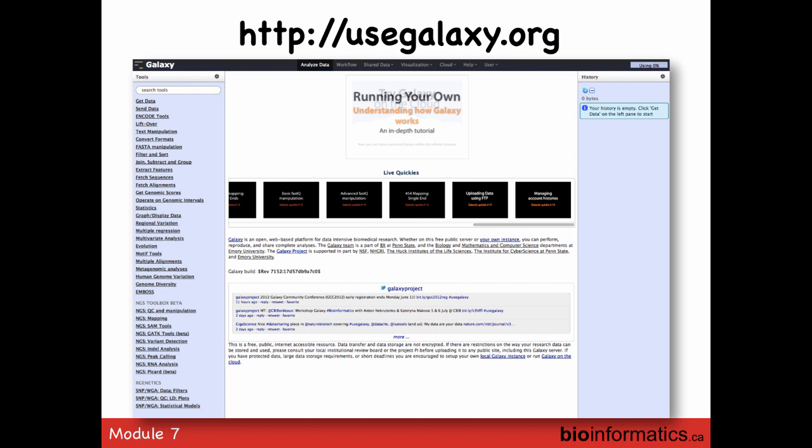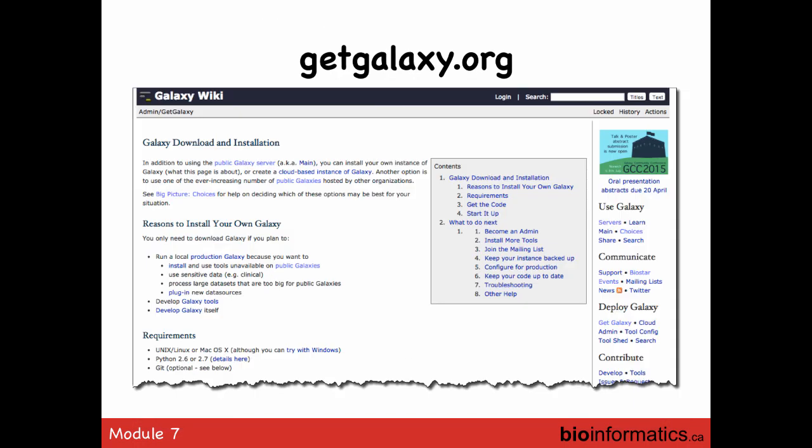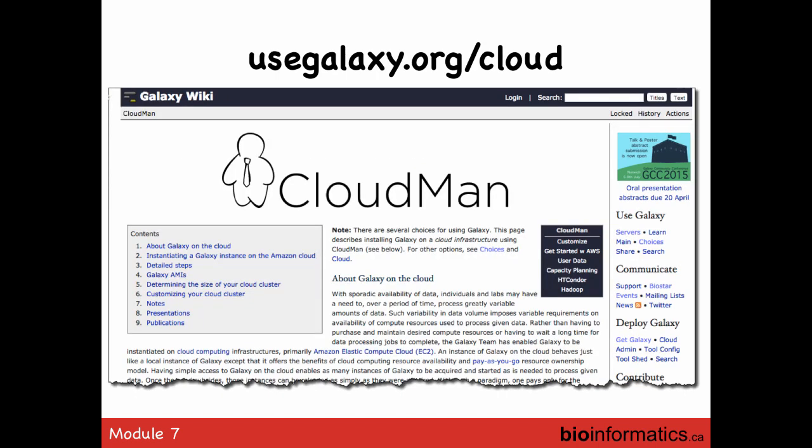This is the usegalaxy.org interface — where we'll be going later today. The 'Get Galaxy' page is where you download and install the software. The two main installation options are on a single box — a laptop or a more robust server — or in front of a cluster so it can use the full power of a cluster. For an institution like a university, it makes quite a lot of sense to install an instance of Galaxy for their bioinformatics community, and many have done that.